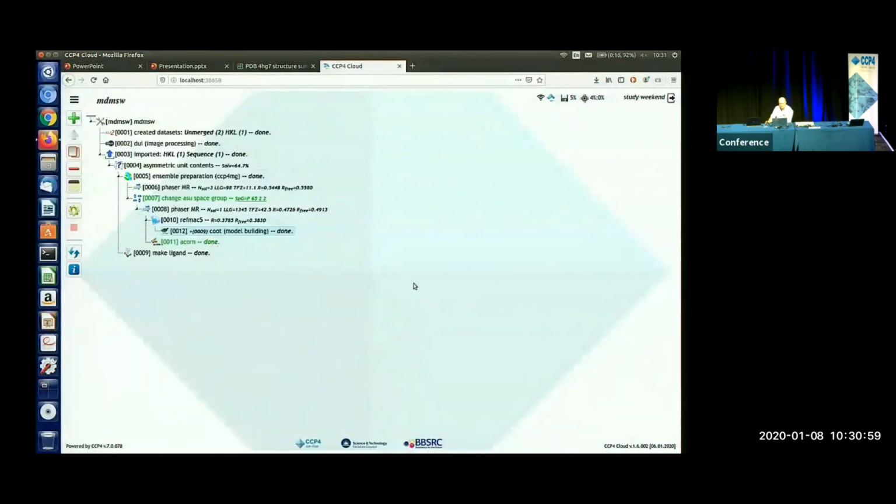I think we're just at time now. So that's basically a brief introduction to how to use the cloud. Eugene and Andre are going to be at the lunchtime bite session. So if you want to give it a go, or you want to hear more about it, please come along to their bite sessions during the lunch times. Okay, thank you.